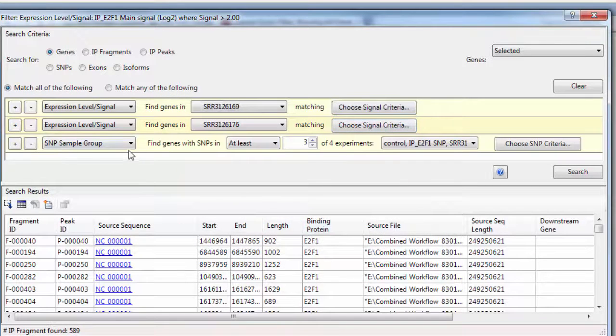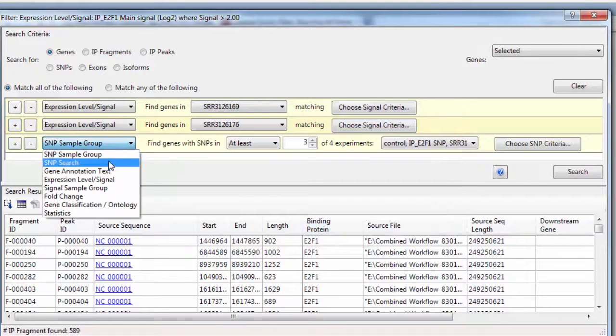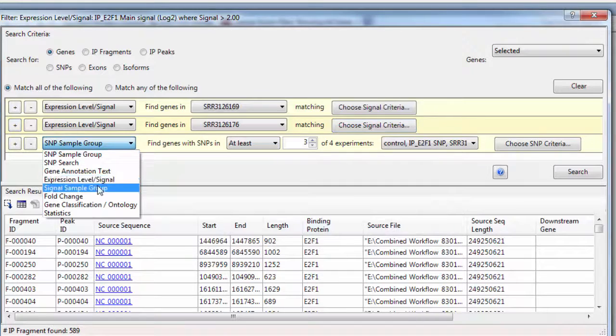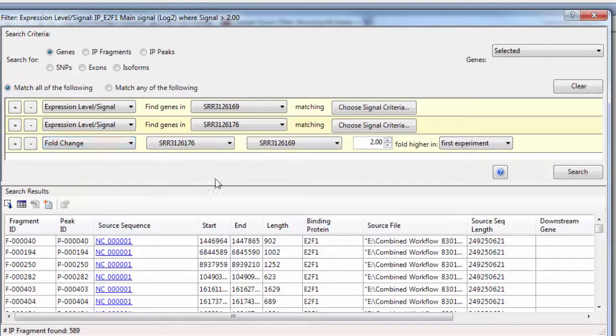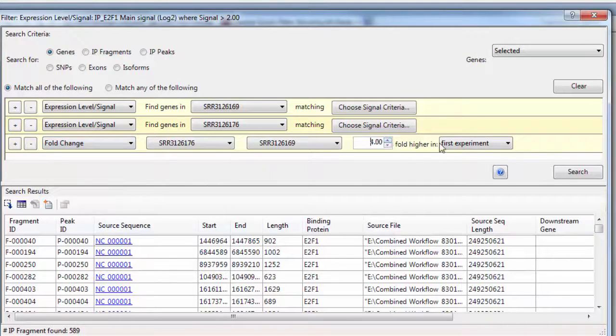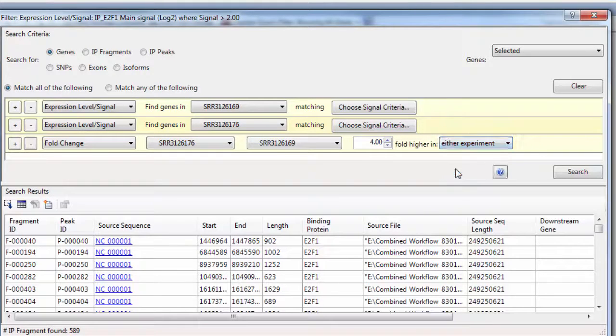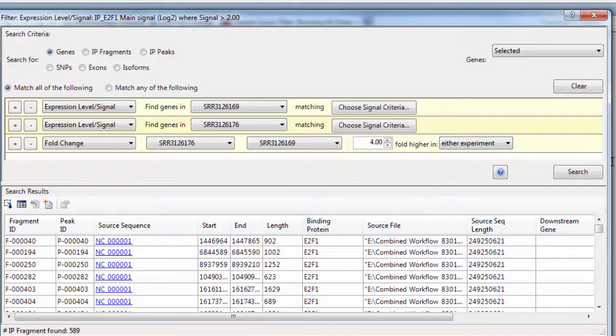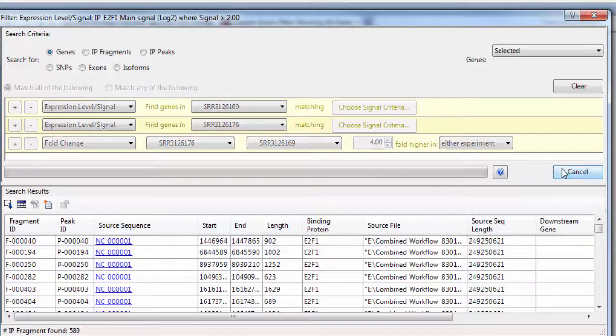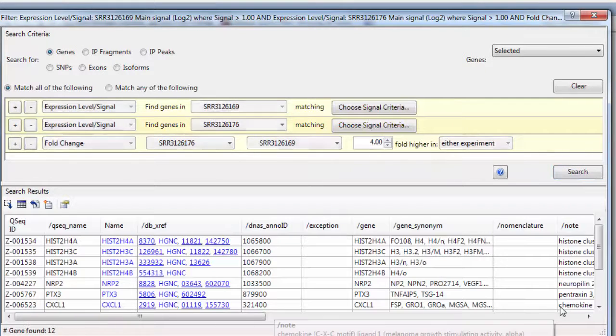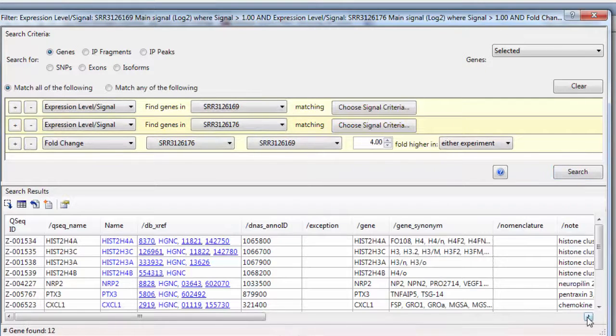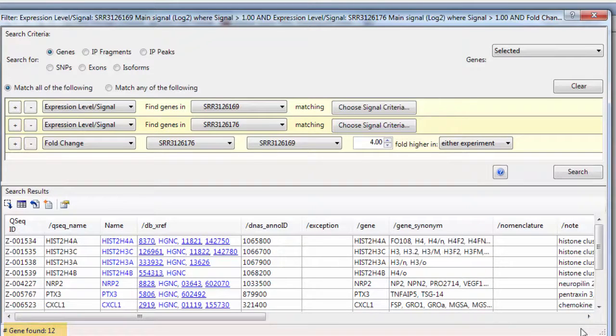And we want to find genes that show a fold change of at least 4 between the two time points. I'll click Search. And that narrowed it down to 12 genes.